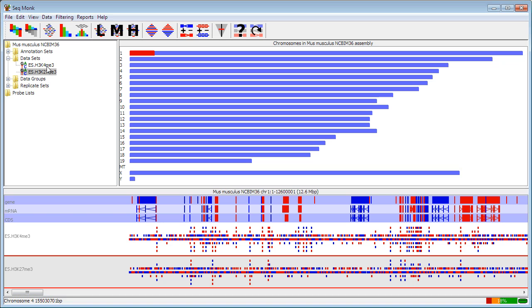If I ended up with files that were from the same library and I just sequenced them more than once, I can combine them together into something called a data group.